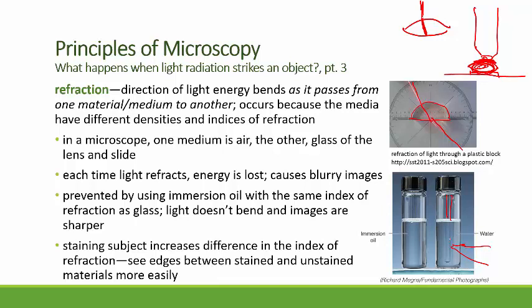It even looks magnified now because as we refract things through curved surfaces, it changes the magnification. That's the point of a lens, that we're focusing and changing magnification of the light as it passes through the lens. And so that curved glass acts like a lens, and so does the water as it refracts. And so we see a magnified rod when we look down into the water.